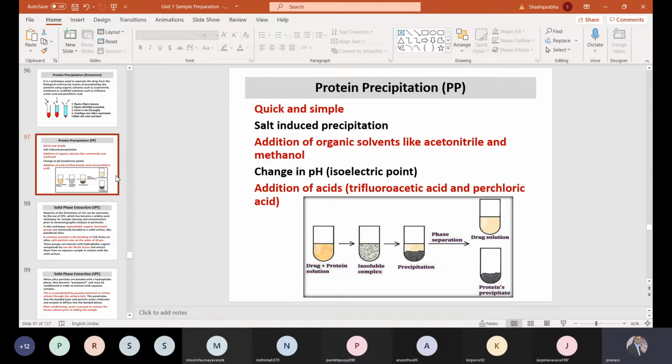The main crux of that extraction is that we want to again reduce the time, maintain the efficiency, and minimize any other processes other than the desired process. The major difference between that and the other technique is that it is diffusion controlled and the heat and mass transfer occur in the same direction. So these are some of the salient features of these techniques.